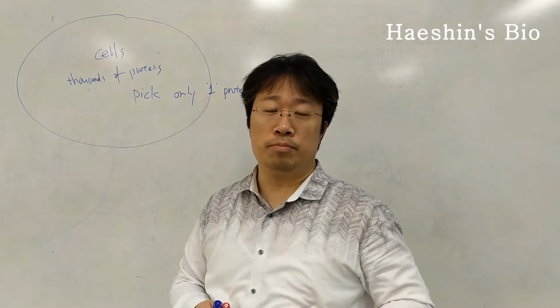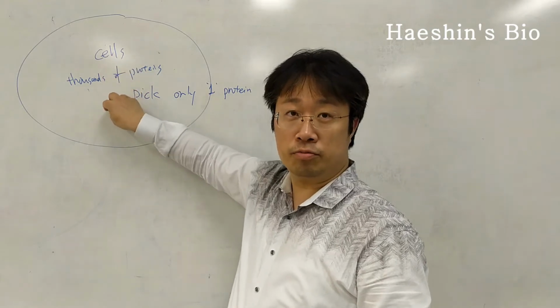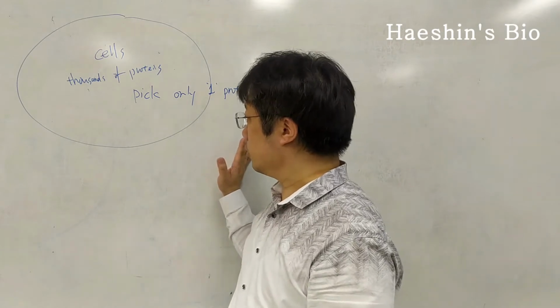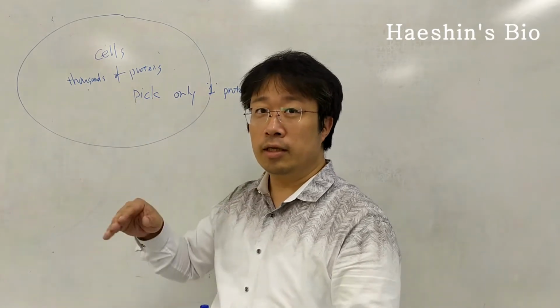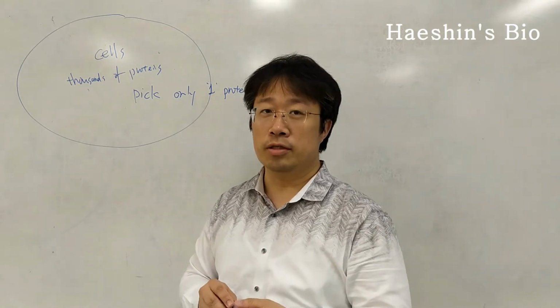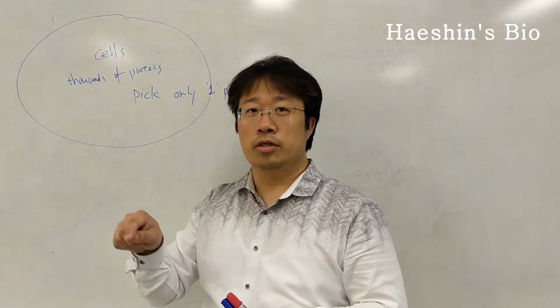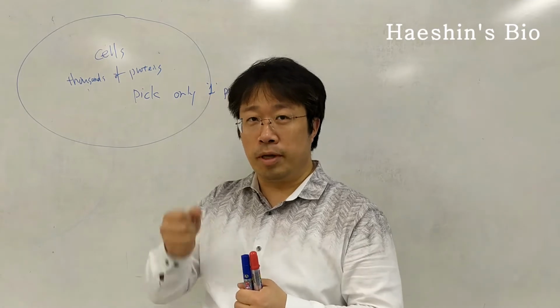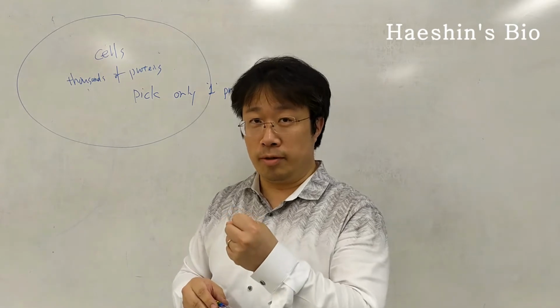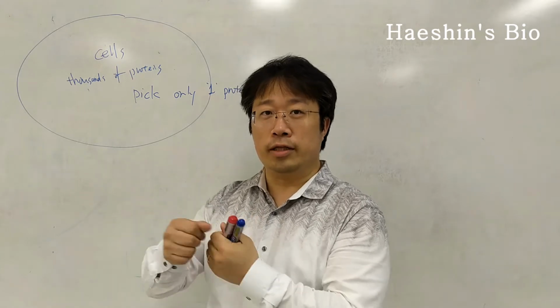In a different case, the cells are not overproducing a particularly important protein, but generally speaking, biologists, especially cell biologists, want to study protein-to-protein interactions, through which signals from the outside or the inside are communicated. Biologists want to know signaling networks through protein-protein interactions, so the most important technique is to purify the protein, so that we can figure out which proteins are connecting to each other.